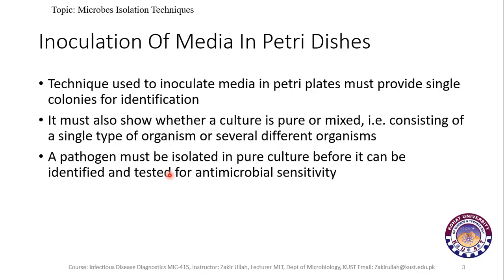Because if we do not isolate a pure culture of the microbe and perform antibiotic sensitivity testing, that antibiotic testing is inappropriate, and our report may have a bad impact, or it can even lead to death, and it can lead to microbial resistance or abuse of different antibiotics.